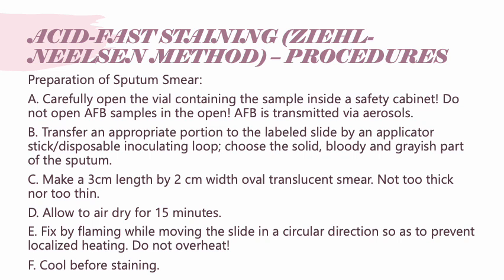Please take note that the disposable inoculating loop and applicator stick should be disinfected first before disposal by submerging them inside a container with sand and sodium hypochlorite solution. So always disinfect and practice aseptic technique before and after experimentation.